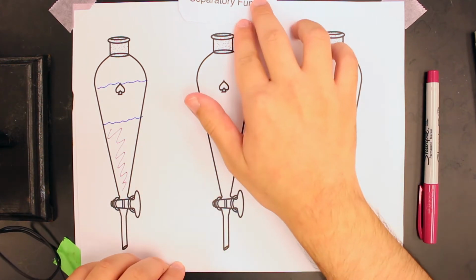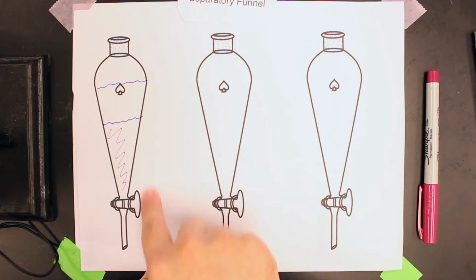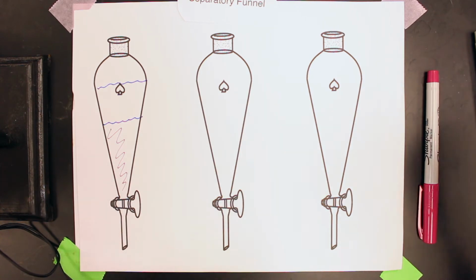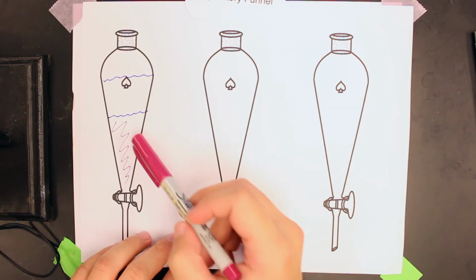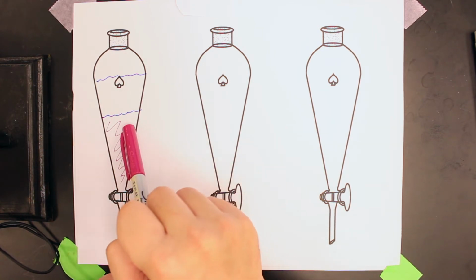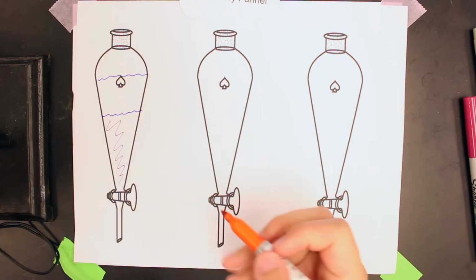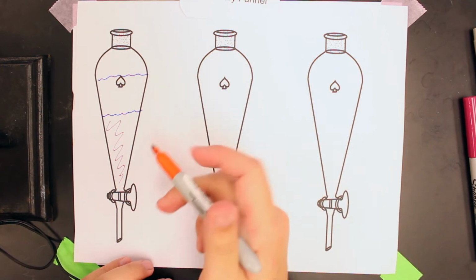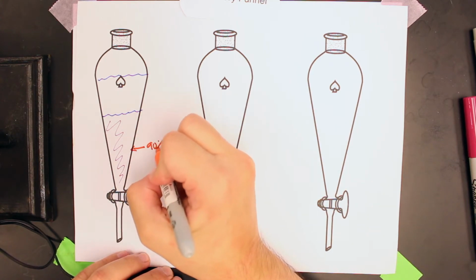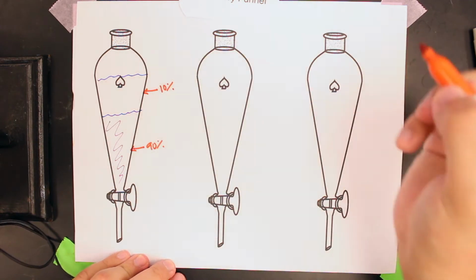Now, the issue here is how many times do we extract? How many times do we add dichloromethane and drain off the layer? Well, if we were to do one extraction, we wouldn't get all of it, and here's why. There is an equilibrium of how much eugenol exists in the water layer and how much eugenol exists in the dichloromethane layer. And typically it's around 90%. So say for example, we perform our extraction, we add our dichloromethane, this layer will consist of about 90% of the eugenol we started with, and this will consist of about 10%.